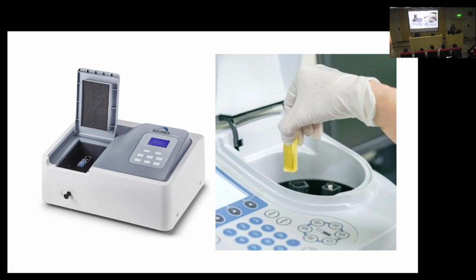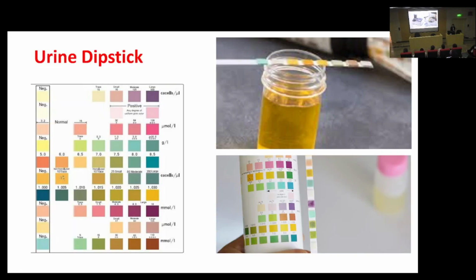All right, so they come in different sizes, different shapes. Please go downstairs and have a look. Now, before I release you, I'd like to talk about a dipstick. That is another exercise that you'll do. Chromatography, we separate components from each other in mixtures, and we're identifying what this mixture is composed of. We talked about centrifugation, also as a separation technique. We talked about spectrophotometry to measure proteins, maybe concentrations of proteins and densities.